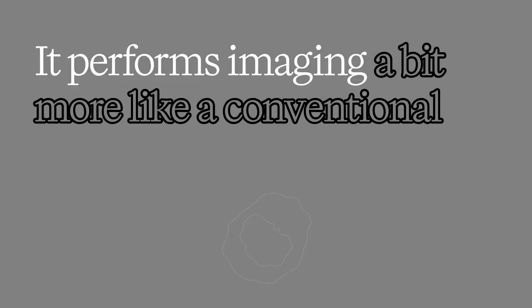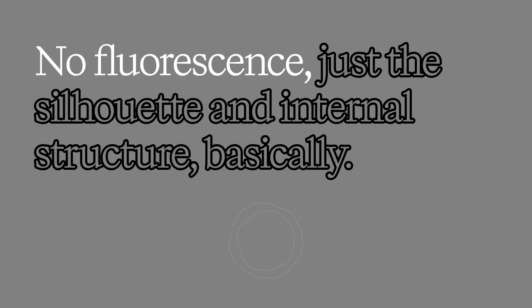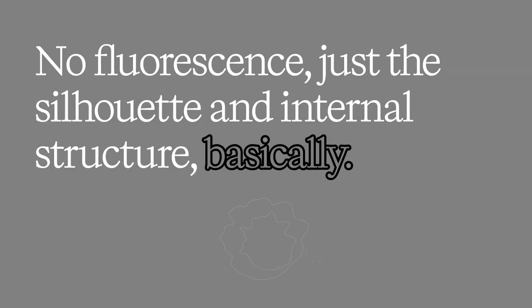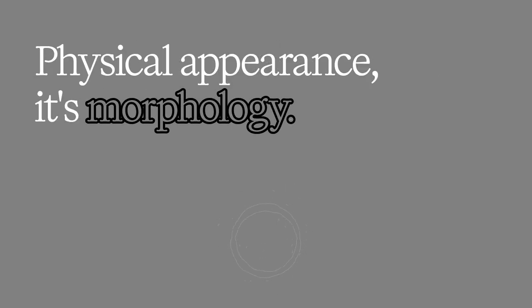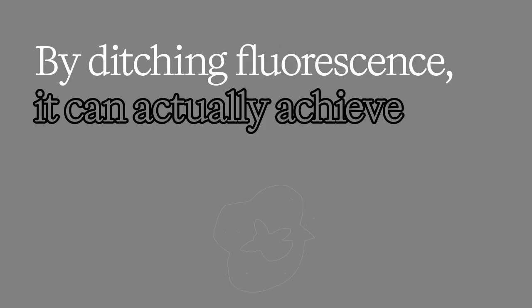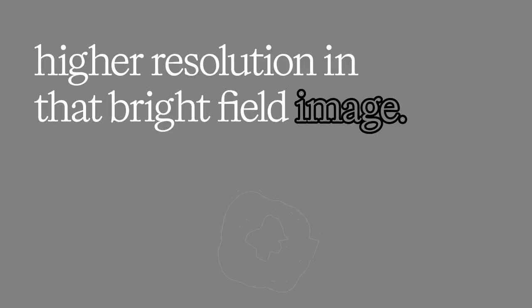It performs imaging a bit more like a conventional microscope, but, and this is the key difference, it captures only bright field images, no fluorescence. Just the silhouette and internal structure, basically. Exactly. Focusing purely on the cell's physical appearance, its morphology. By ditching fluorescence, it can actually achieve higher resolution in that bright field image.